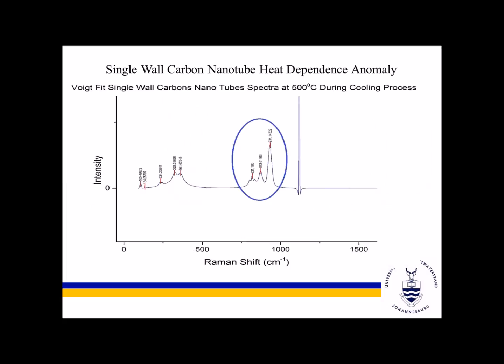So again, we see on the right of the reference peak, there's no carbon bonding. There's no carbon within the system according to the Raman spectrum. But we do start to see new peaks forming, indicating new bond formation within the system. So this disproves that oxygen actually moved into the system and burnt off the sample.